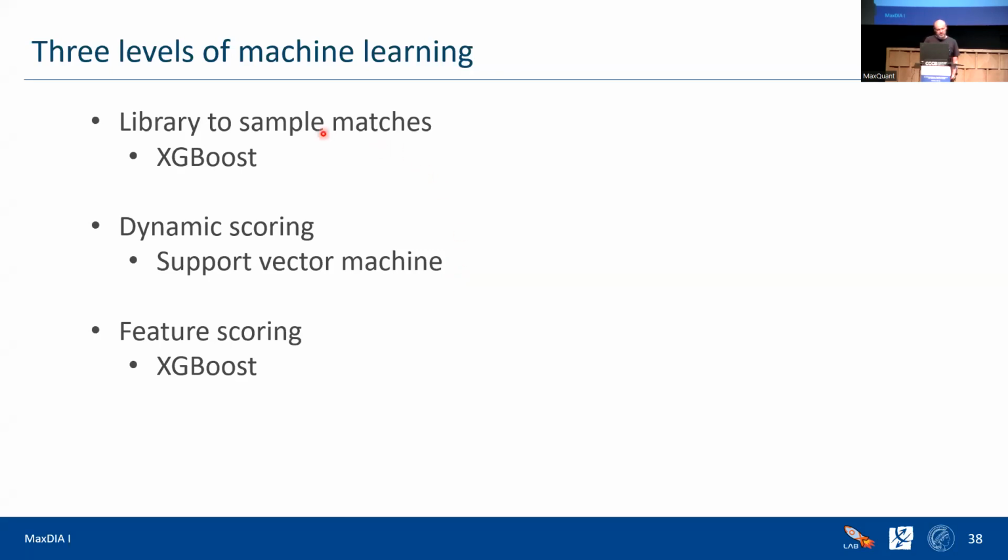The problem with this one here is that it can only improve things that it sees. It's a little bit the same situation with the machine learning improved score in DDA. Most often you just rescore the top hits of the first level and not all of the sub-leading hits.